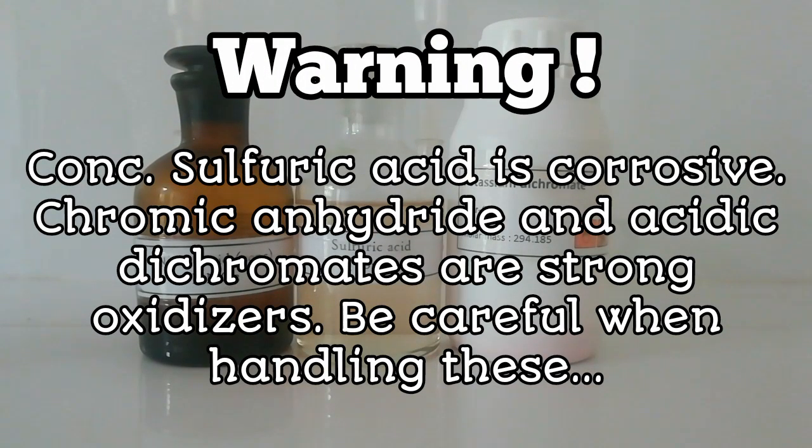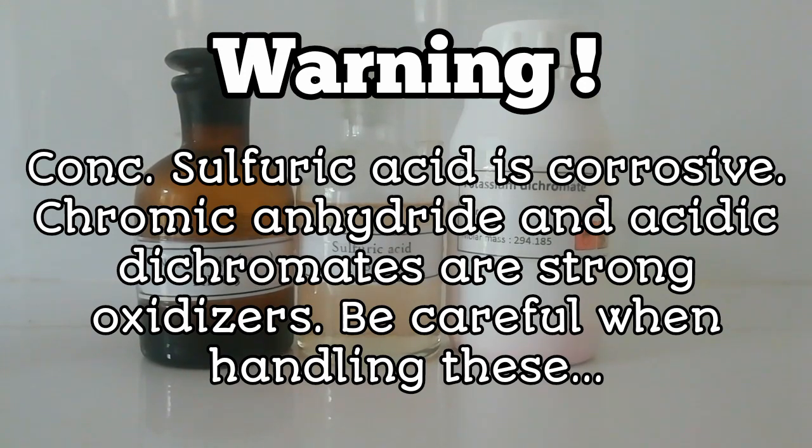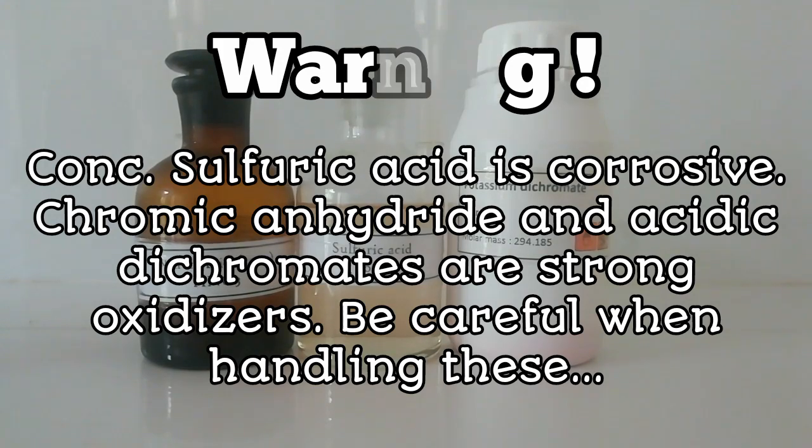Warning: Concentrated sulfuric acid is corrosive. Chromic anhydride and acidic dichromates are strong oxidizers. Be careful when handling this.